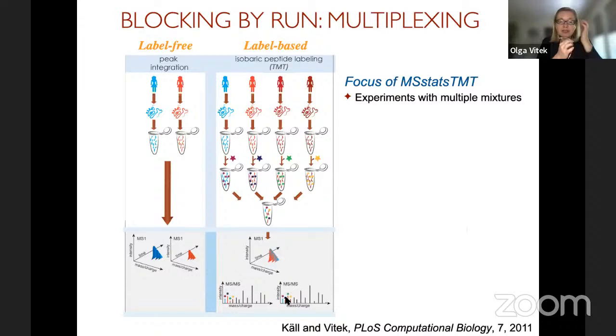Just because there was less biological material during this time. So as a group, these reporter ions tend to vary together, higher or lower. And so statistically, we have to account for these differences, right? Because they represent the technology and not the biology.